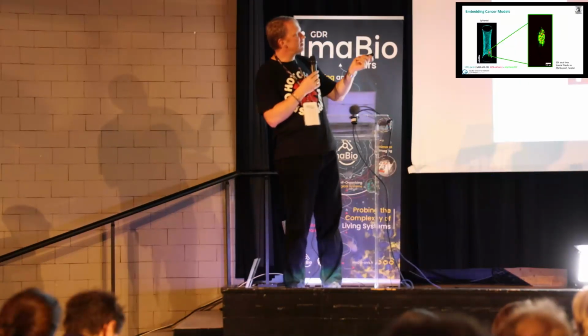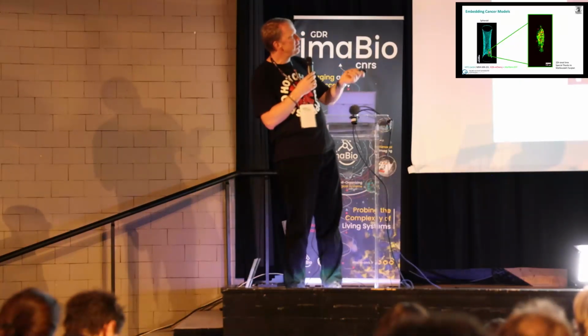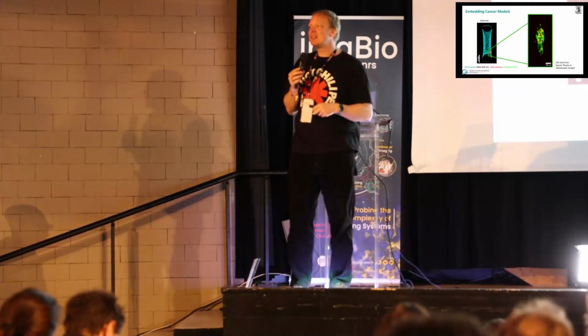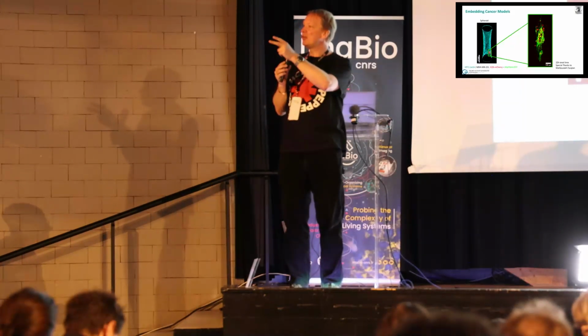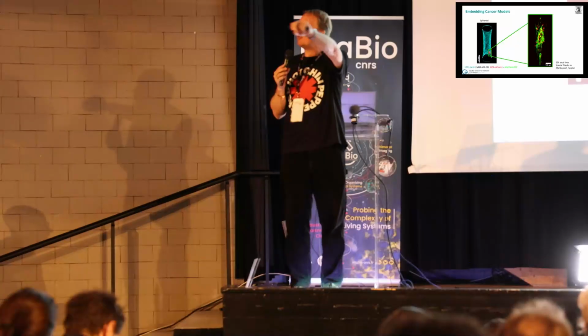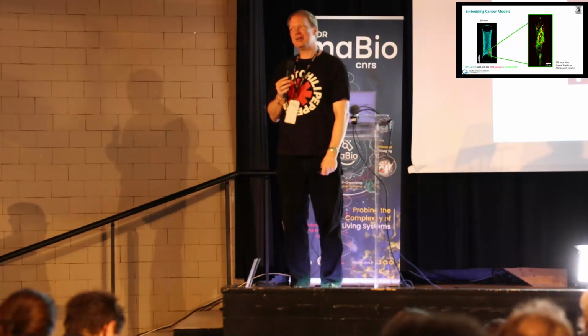Then we can start looking at this. The cool thing about it is that it's directional. You can see that there is a mechanical force and these cells move out. But we haven't done that, and I think it's an extremely interesting question. One could also try the other way around, having monoclonal cells and then taking the ones that are out and trying to do a proteome or transcriptome of these. Yeah, exactly. But no, we haven't done it.